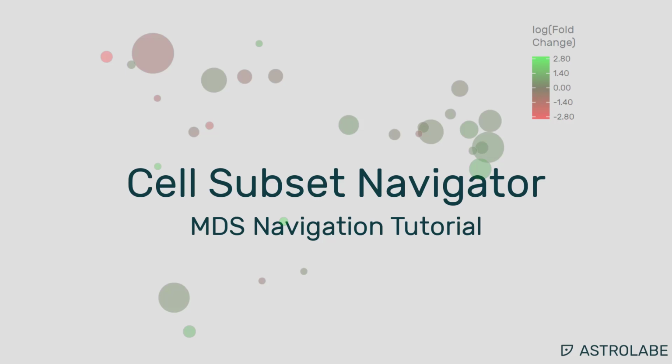Hello, and welcome back to this tutorial for Astrolabe's Cell Subset Navigator. In this video, I'm going to show the MDS Map visualization.